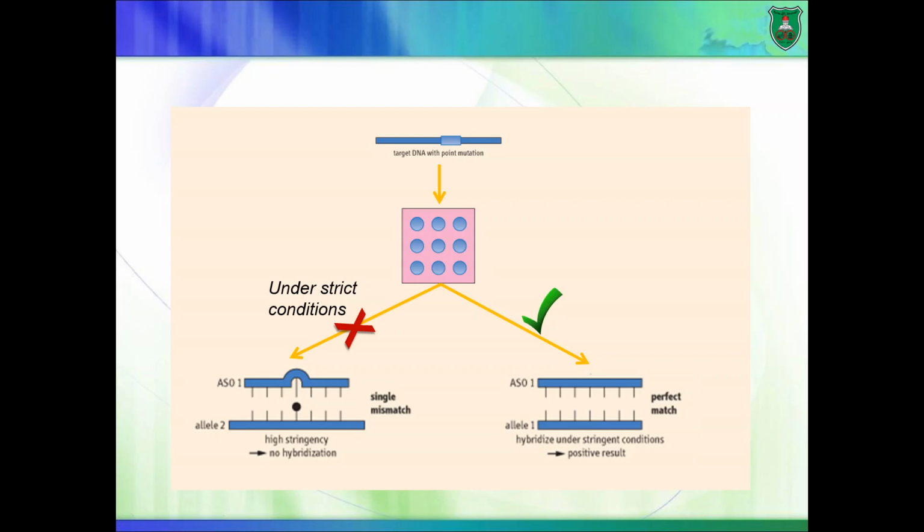Okay, so it's not something that is unknown. And I place my DNA on a piece of paper right here. Okay, and I add a probe, and the probe emits a signal. Well, if there is a sequence that is complementary to the large DNA molecule, then you will have the formation of an interaction, hybridization between the two DNA strands.